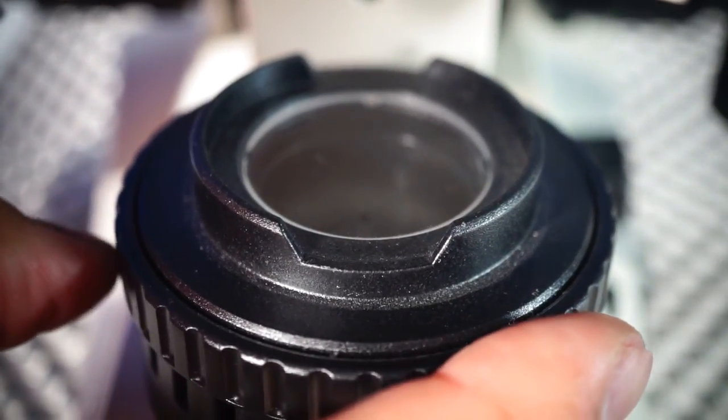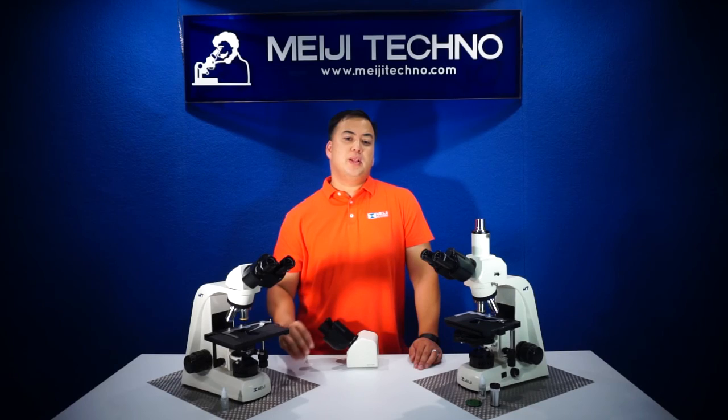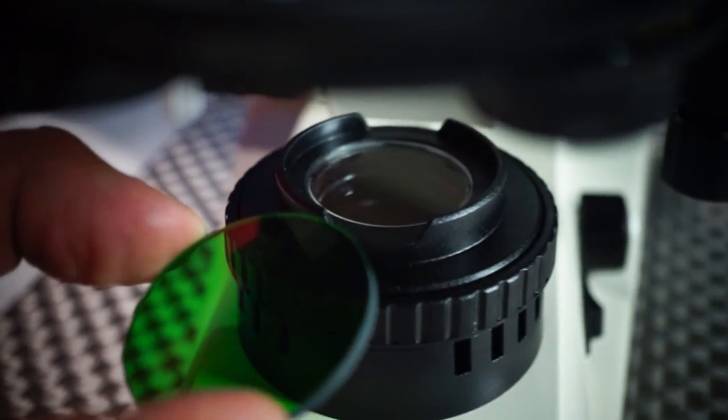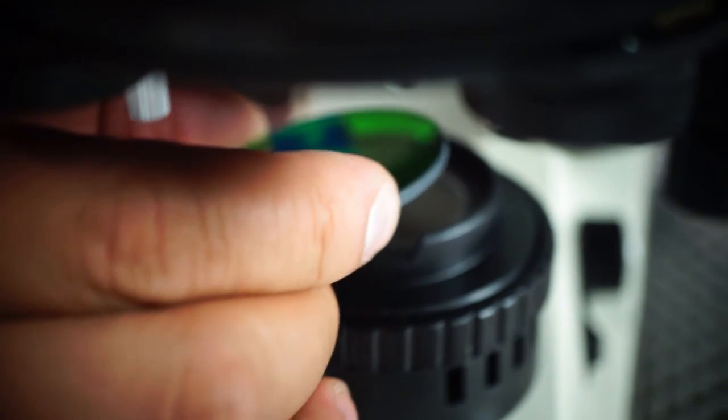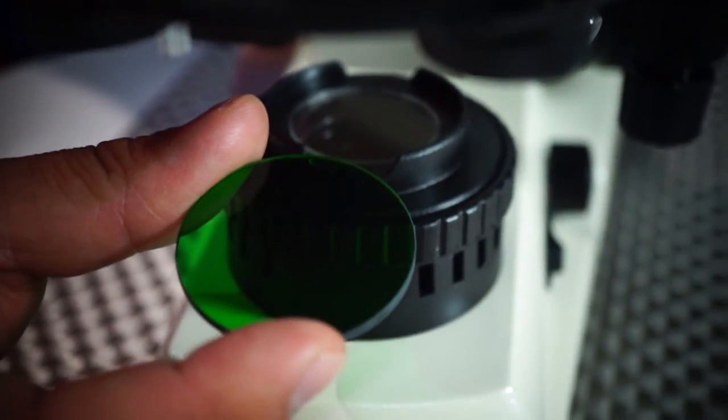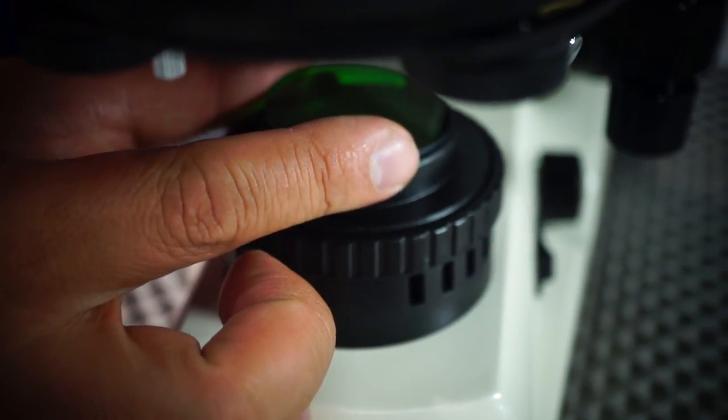This is very newly designed by Meiji Techno. 40 millimeter unmounted filters can also be placed directly on the filter tray above the aperture. The improved iris control operates and tracks very smoothly, facilitating accurate iris control to improve usability and light control.